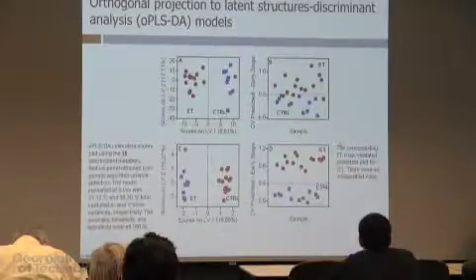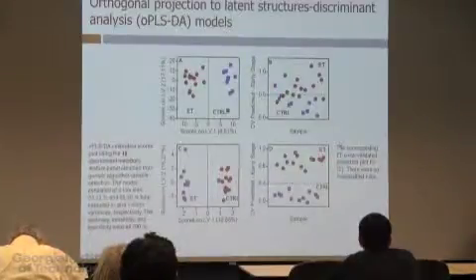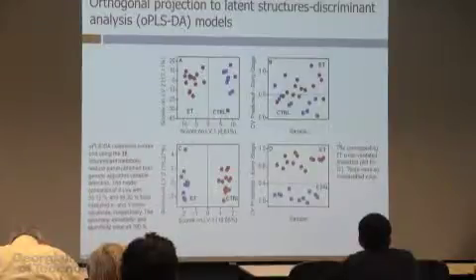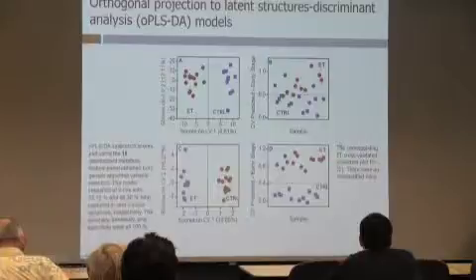The reason why it works so well even in the test phase is because these are mice. So these are relatively homogeneous populations of samples. Okay? I'm going to show you work with humans. It doesn't work so well. Okay? But in mice, sometimes you can expect this.